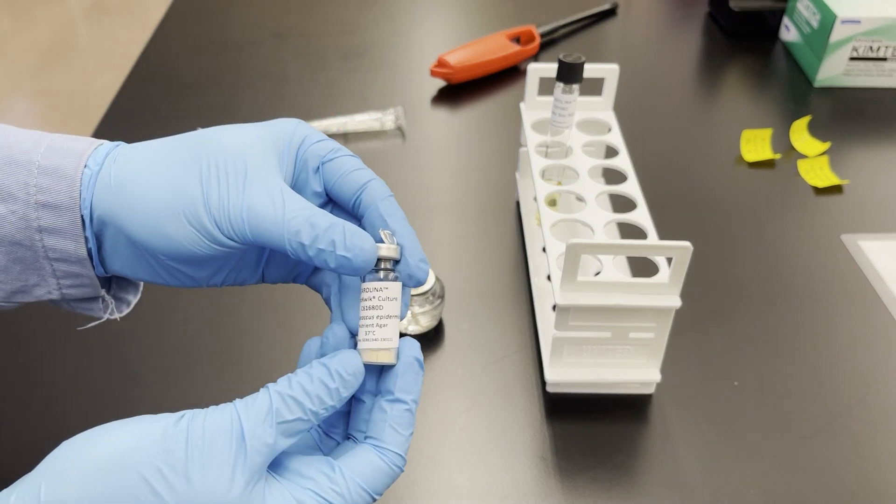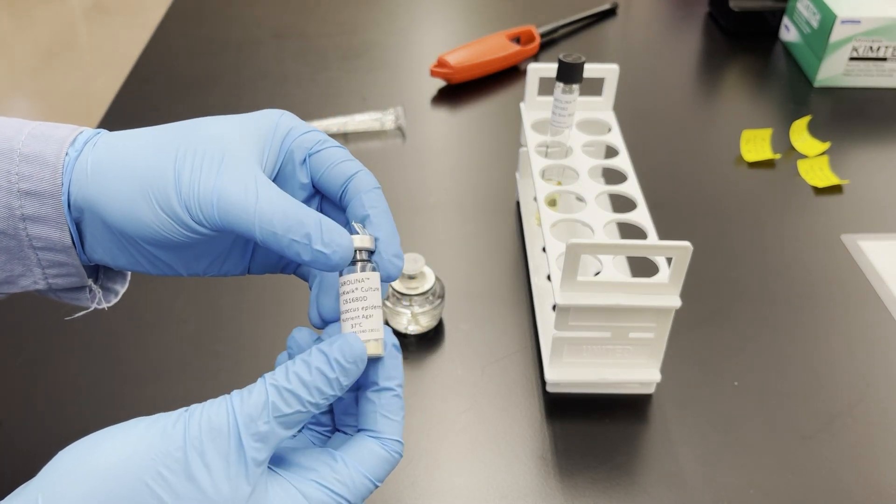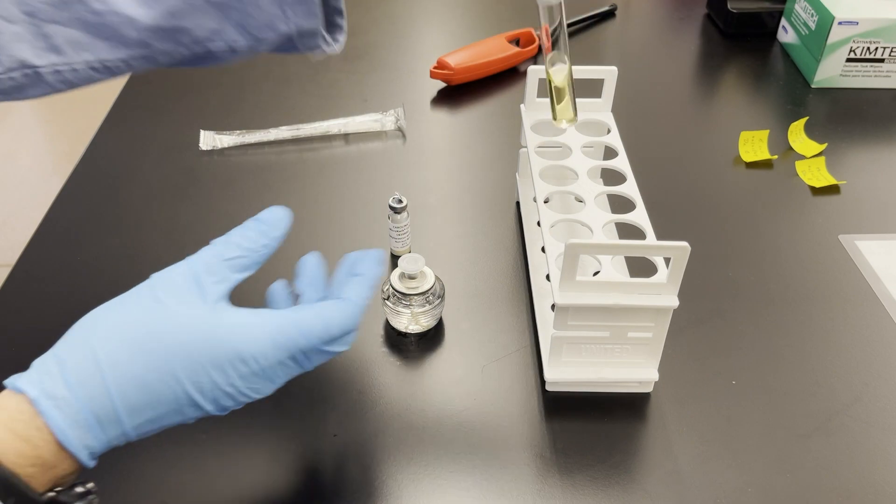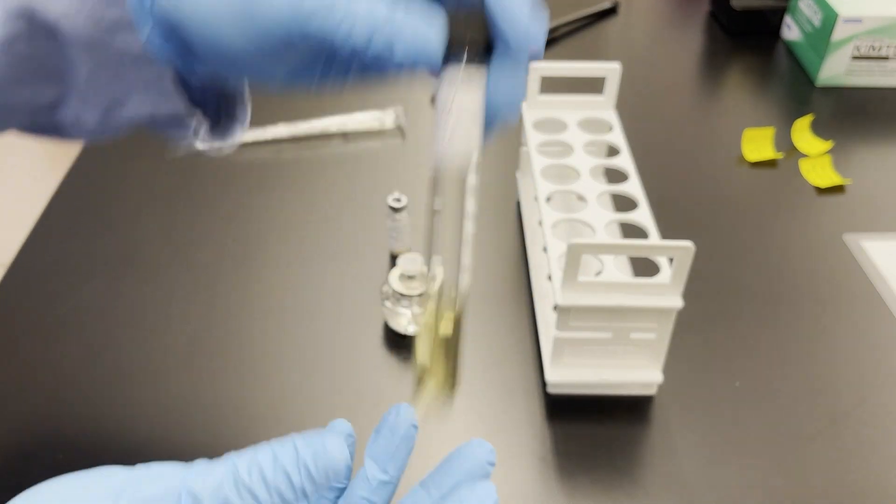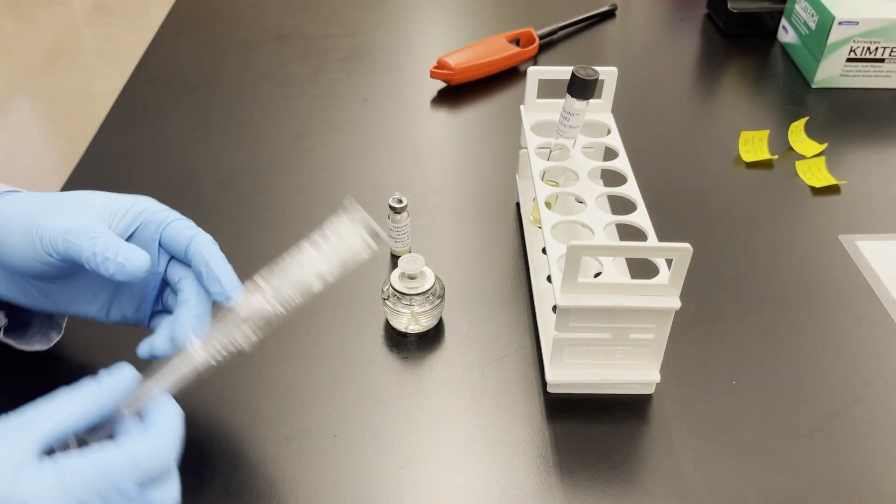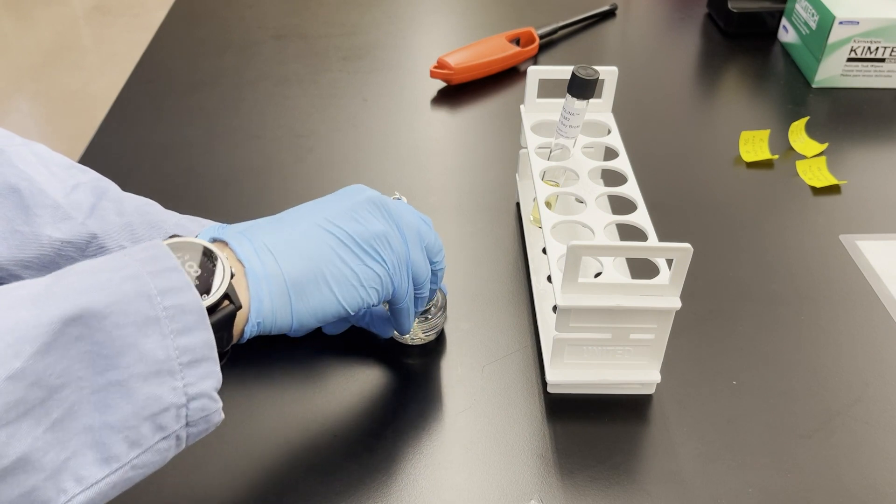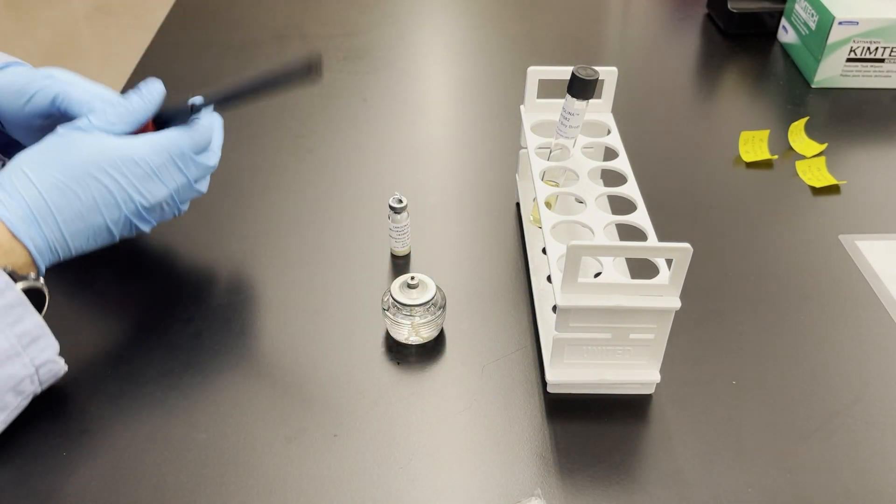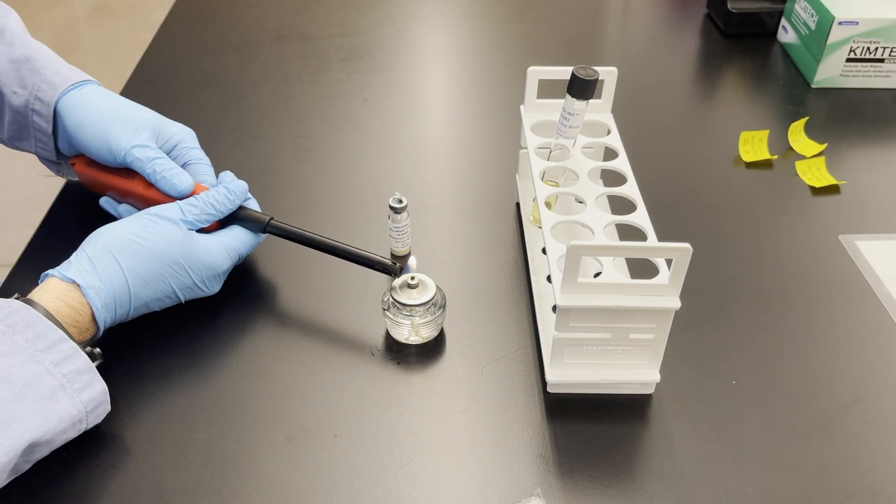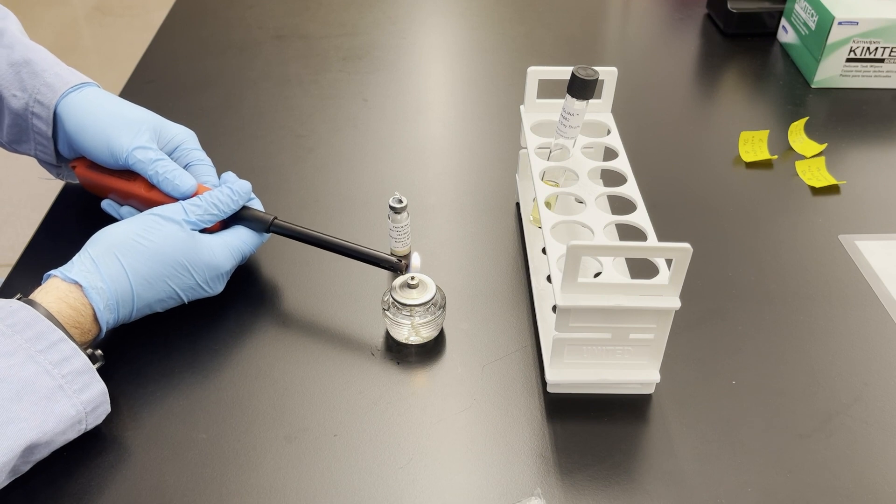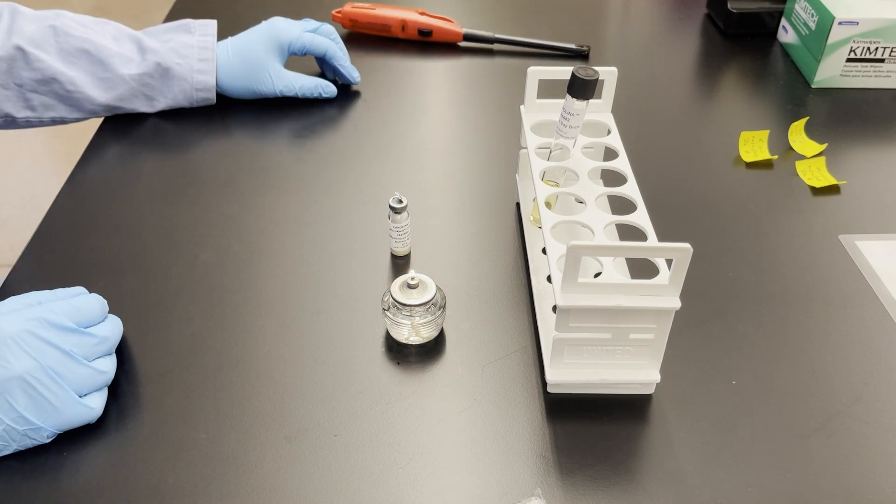Notice I have a container of lyophilized bacteria and the goal is to activate it and get it growing in this tube of broth. You're going to need your alcohol lamp and something to light it with. Just keep this on for the period of time you need to complete this activity. Don't leave an open flame on.